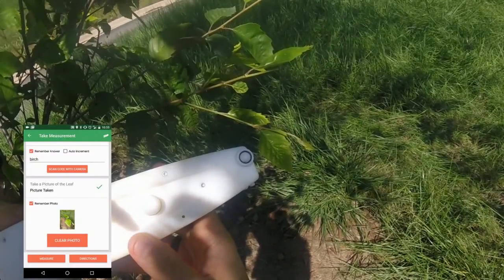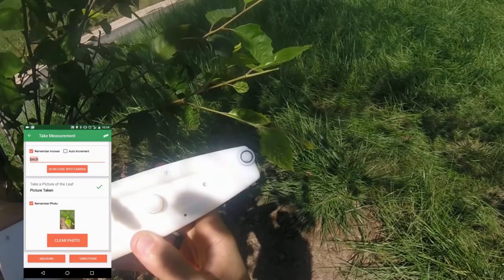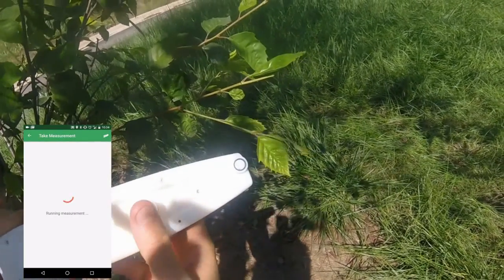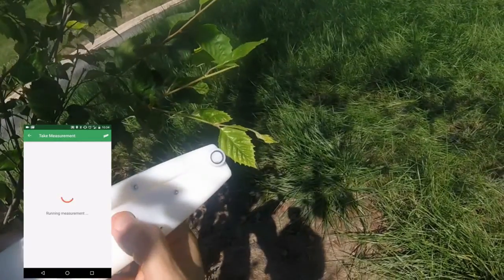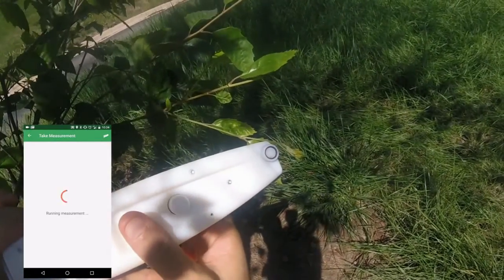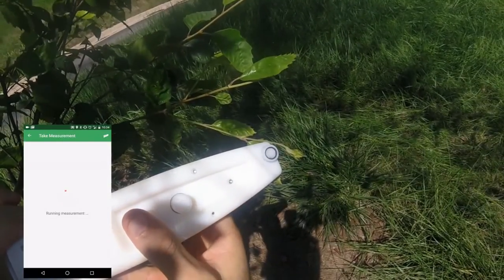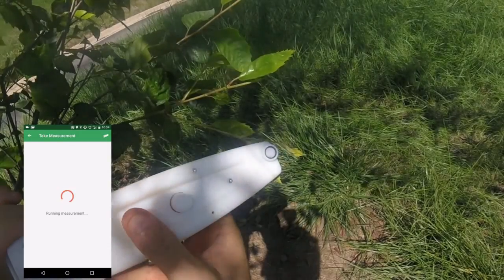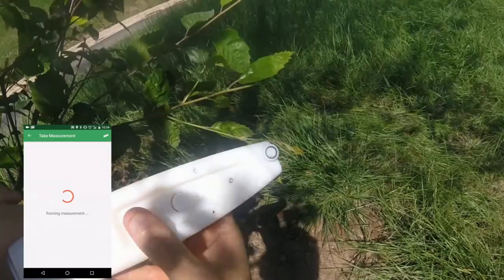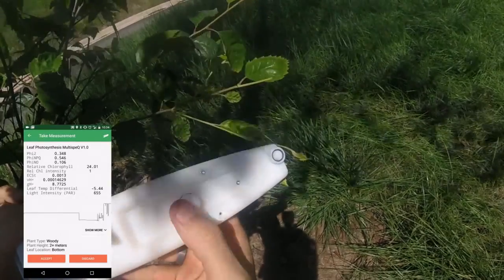Now we're ready to take our first measurement in the Getting Started with Photosync project. Click Measure, wait a second while the device receives the instructions from your phone, then clamp the leaf to start the measurement. The measurement starts automatically when the clamp closes on the leaf. The leaf photosynthesis protocol takes about 15 to 20 seconds to complete. You just took your first measurement.